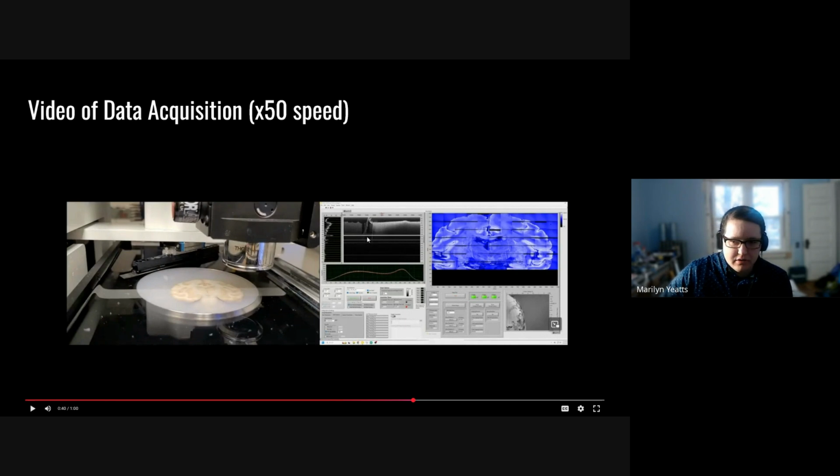What you're seeing here is the reference line, the actual tissue signal, and then these other lines are reflection artifacts of the system. It's impossible to completely eliminate them, but we do remove them in our post-processing via background subtraction that's calculated from a given tile.